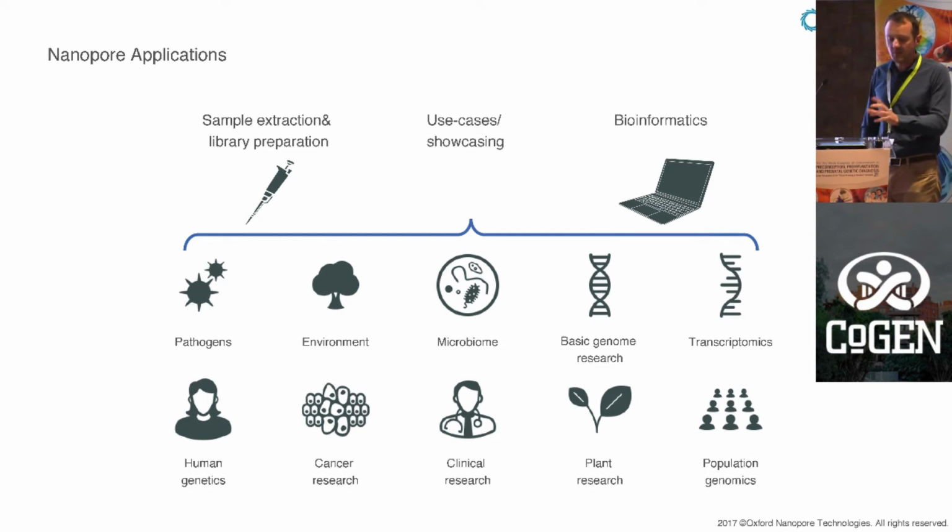minion, attaching those adapters. We have lots of different options available because your priority might be that you want to get to the answer very quickly because you're trying to identify an infectious disease, or it might be that you want very, very long fragments because you're trying to assemble a genome, and we would treat those differently.